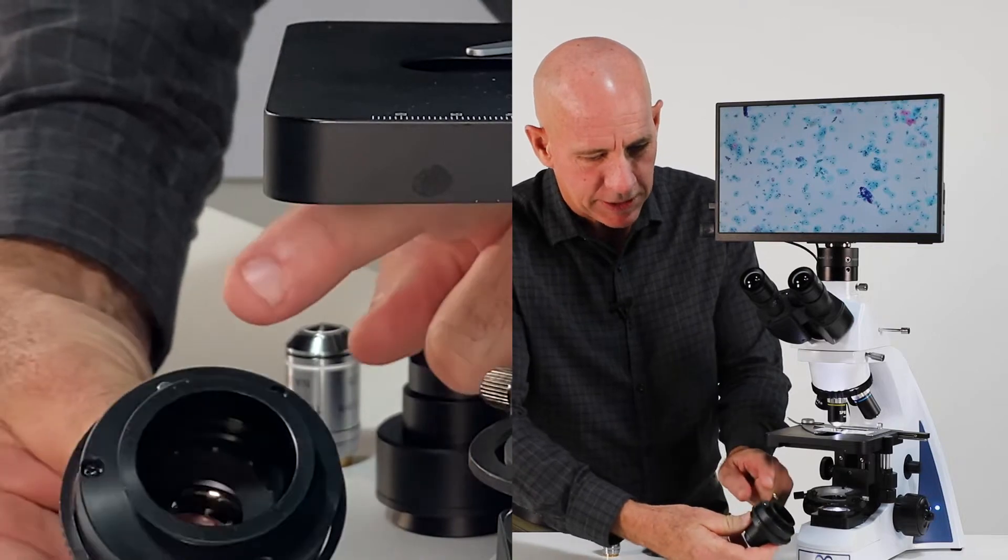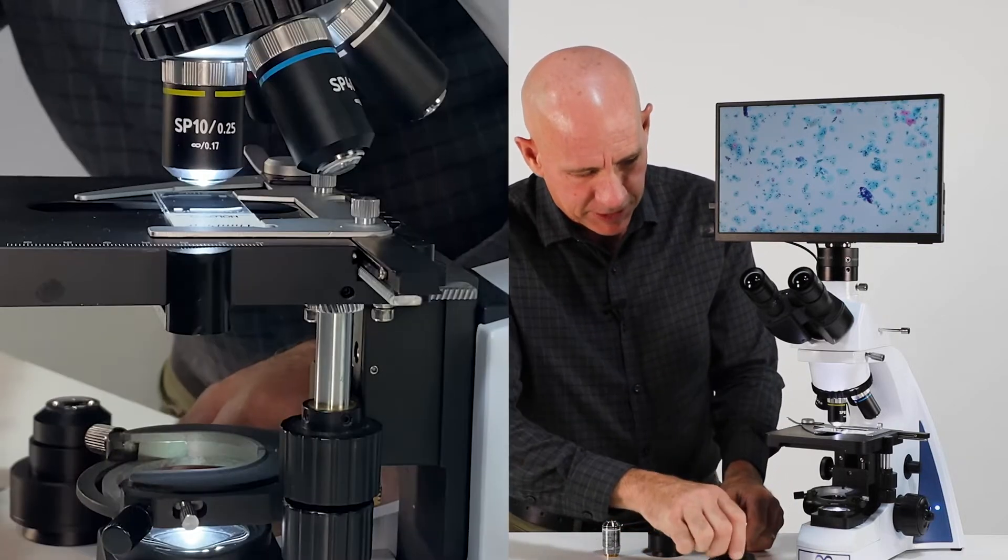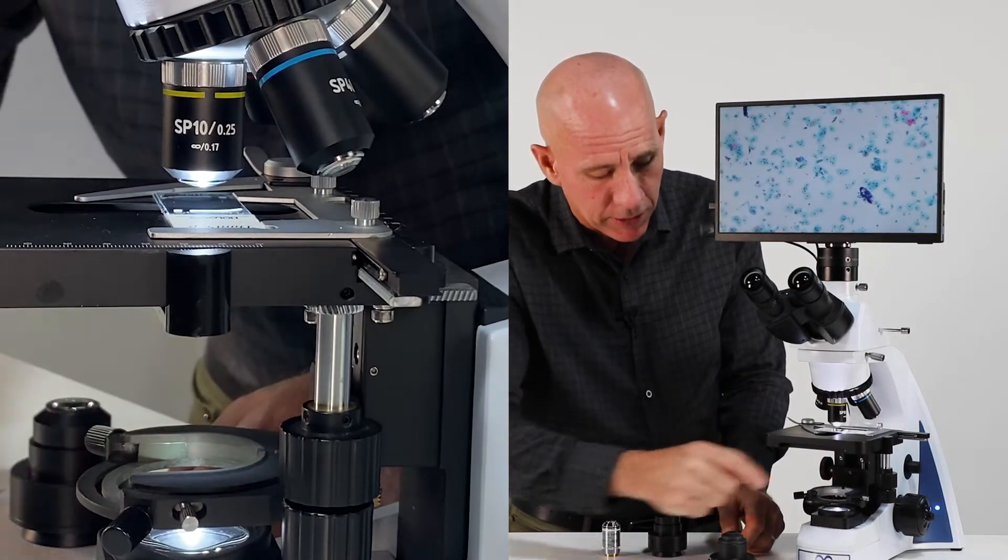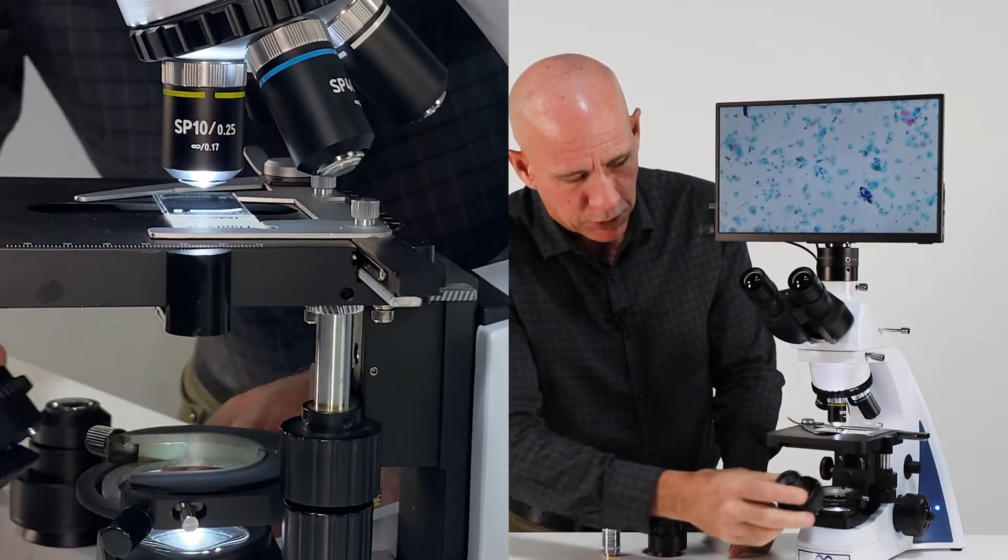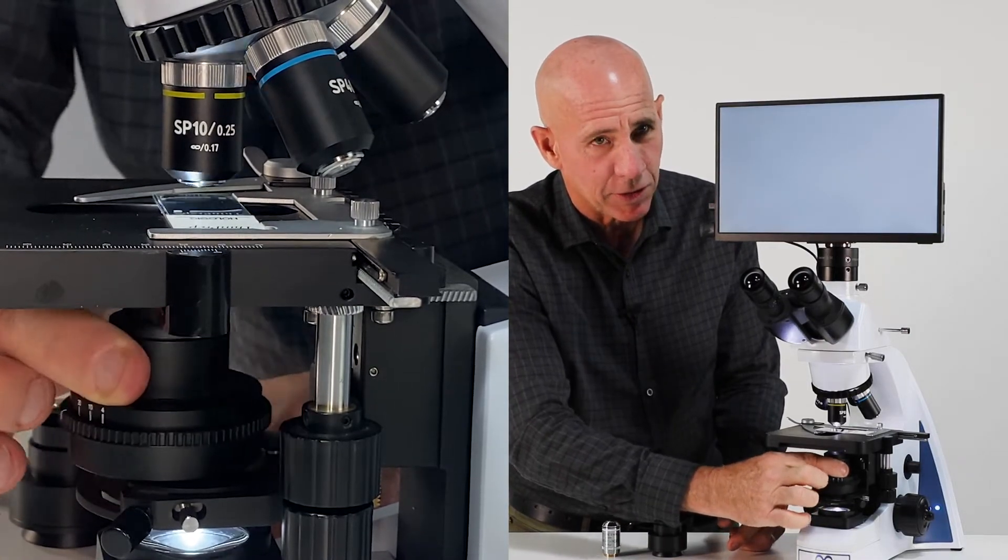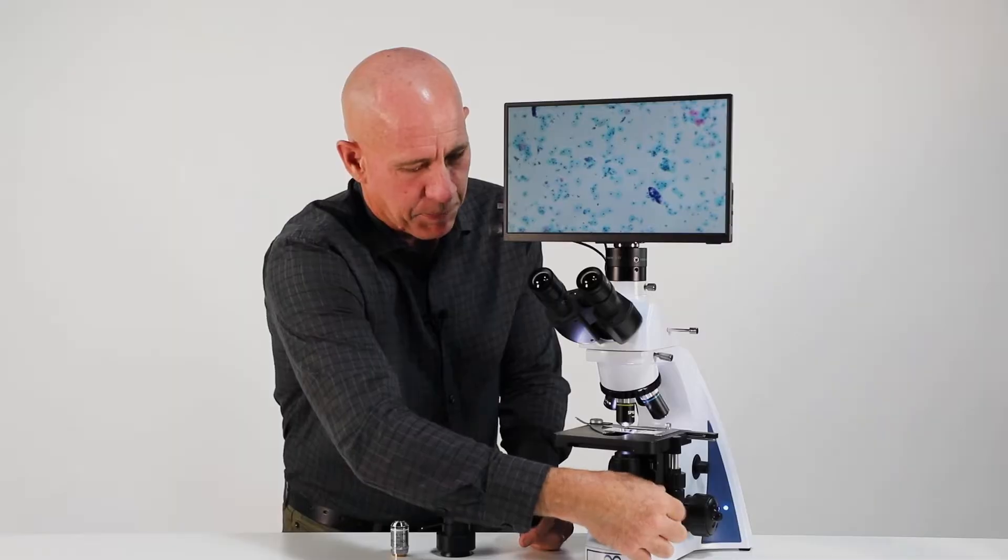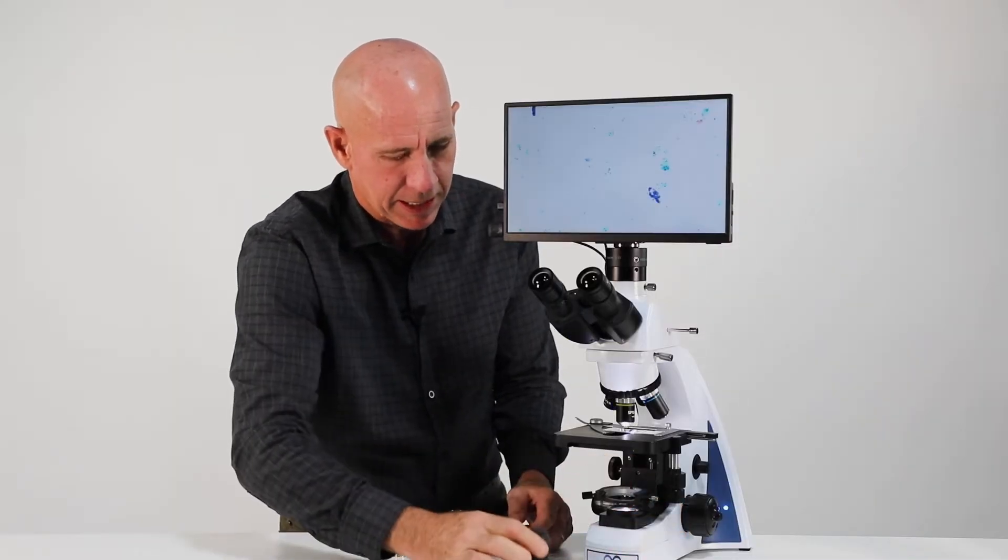Now something to notice is this condenser has a pin on it. There's a slot at the back of this carrier, so when you push in your bright field condenser you have to make sure to hit the slot. So notice I missed and now I hit, and that's how you put in your bright field.